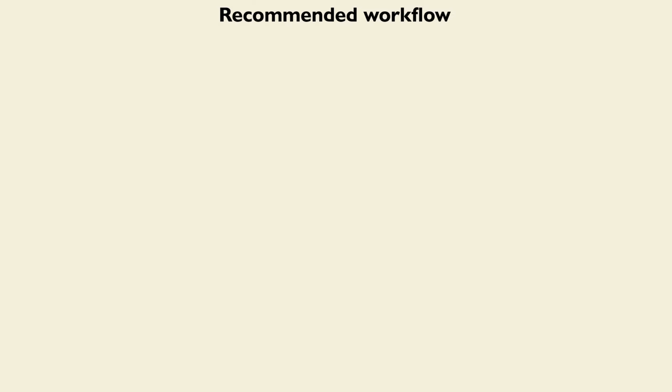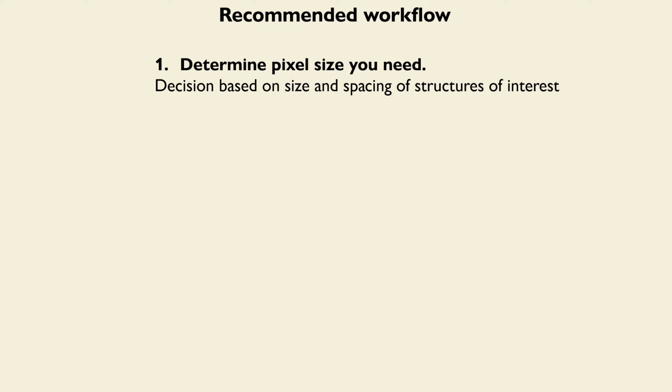So what is the recommended workflow? The recommended workflow is first, determine the pixel size that you need. And this decision is going to be based on the size and spacing of whatever structures you're interested in. So if you're interested in nuclei, you've got to get one answer. If you're interested in the microstructure of mitochondria, you're going to get a very different answer.